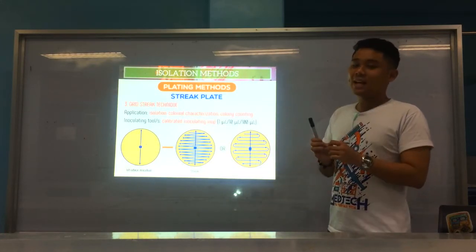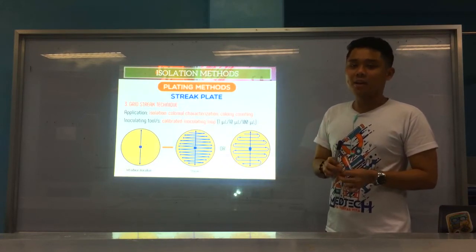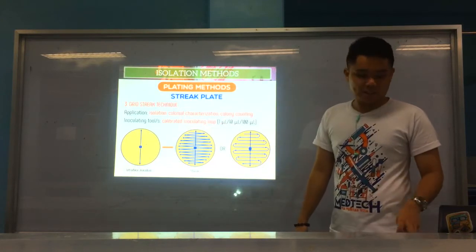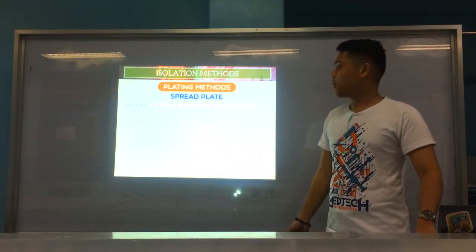So the purpose of this is for colony counting. You can count the colonies individually. Because we want to know the number of colonies. Usually, again, it is used for urine specimens. Urine. Okay. Alright. Next, we have spread plate.